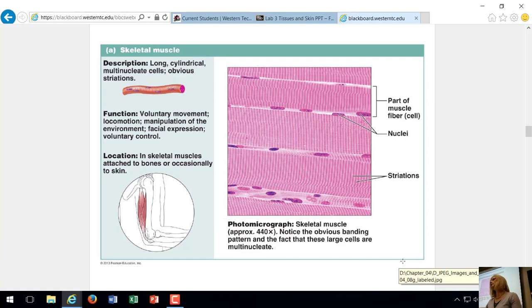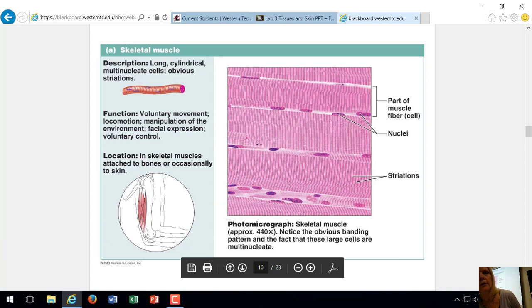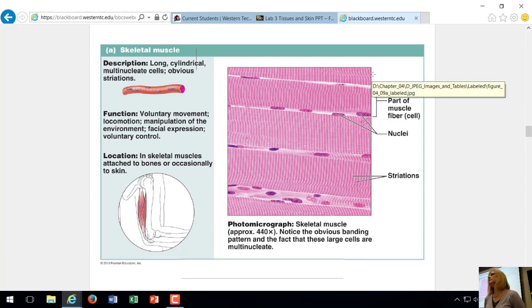That's page 134. And then we get into muscle. Muscle is in its own category. If you look in your chart there, the classification is muscle. So it's not a connective tissue. It's a type of tissue we just call muscle. There's three different types of muscle that we're going to learn about this semester. Right now, all you have to know is skeletal muscle. These are attached to bones. So location, the answer is attached to bones. You can tell skeletal muscle, it sometimes gets confused with dense regular collagenous or fibrous tissue. But notice it has these vertical stripes that are kind of running up and down. That's characteristic of skeletal muscle. Look for the long cells running left to right, but also those vertical stripes running up and down. And they're very regular and have a very unique pattern. That's unique to skeletal muscle.